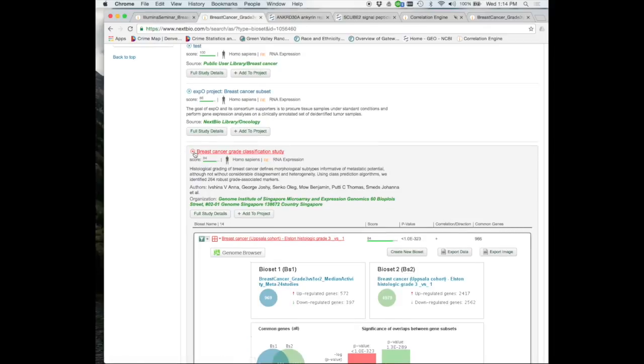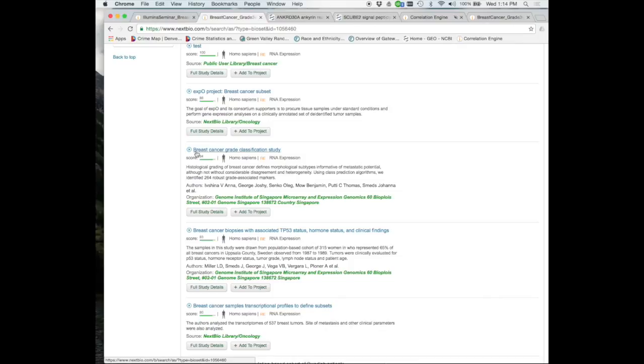Okay. About differentiating between human and mouse. If you're growing a human tumor in a mouse, can you differentiate the genes of the mouse versus the human with this tool? Yes. You would have to do that beforehand, before you uploaded it. I mean, that's an RNA-seq study, right? You're going to have sequence on that. Once you've made that determination, you could just upload the human genes that you wanted. And I have done that. There are a lot of xenograft studies on here as well, so yeah, that's absolutely doable.